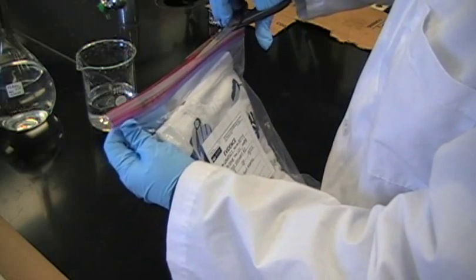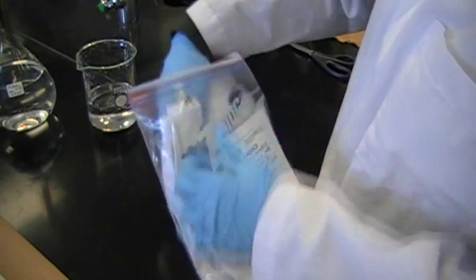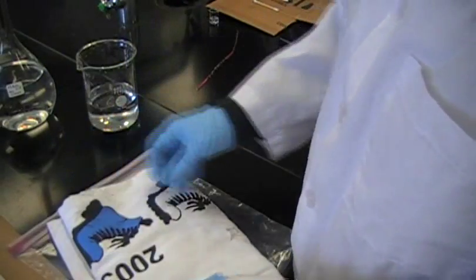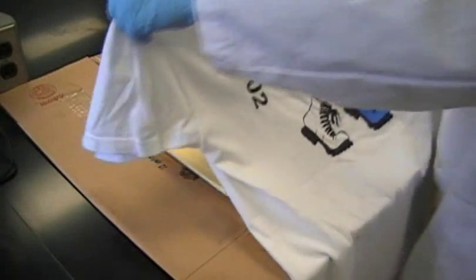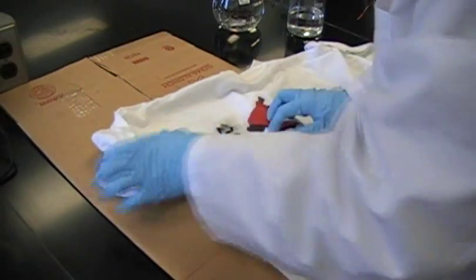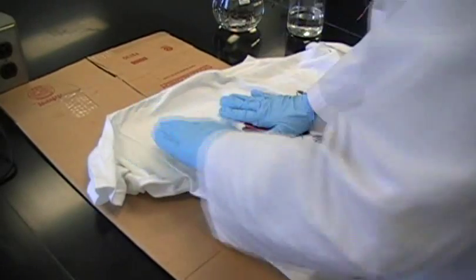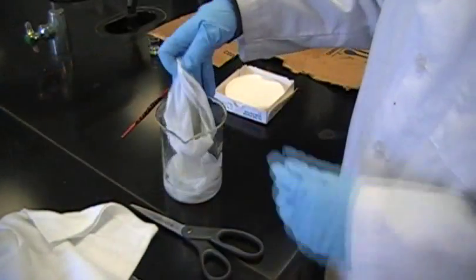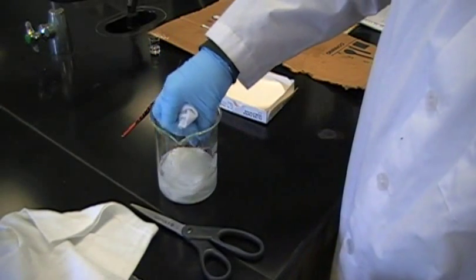The evidence is now ready to be processed. The seal is broken and the evidence is removed carefully. The shirt is placed GSR side down on a prepared photographic paper. A cheesecloth is soaked in acetic acid, wrung out, and placed on top of the evidence.